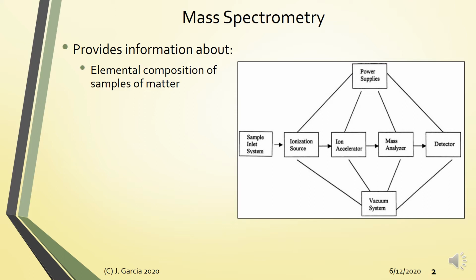So there are two kinds. You have your atomic mass spectrometry. It is actually used for determining the different elements present in a sample. Normally, for atomic mass spectrometry, it is used in tandem with other techniques, such as ICP, inductively coupled plasma mass spectrometry. So in this tandem instrumentation, your mass spectrometer serves as a detector, and you would be able to have a very sensitive way of detecting the elements present in your sample, which was atomized by your plasma.